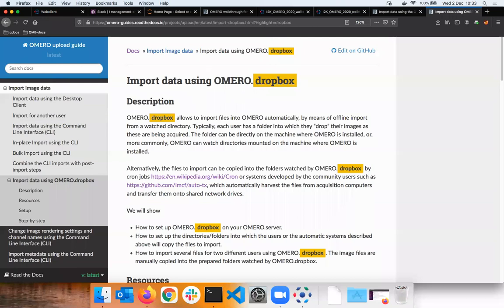And you are not an IT person and you have no idea what a Samba server is, maybe even, and what is the environment. But that's what Jean-Marie needs to know, and the information from your side must be given as well, because this is highly specific from institute to institute.